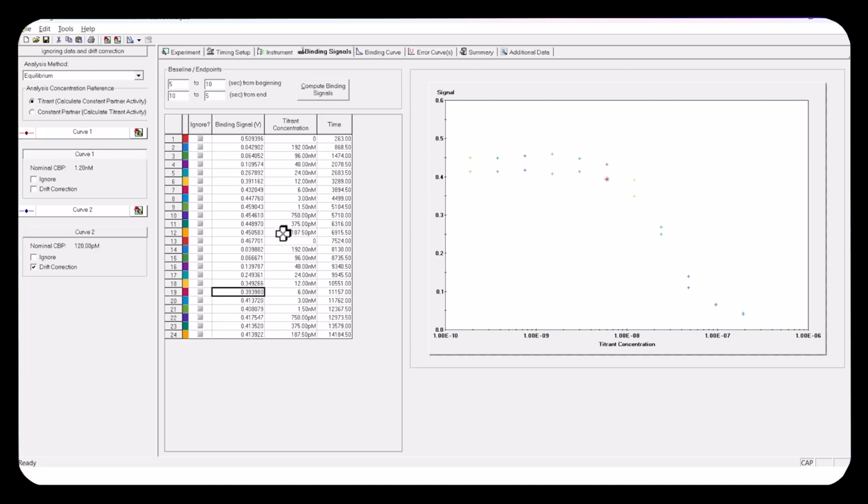I'm looking to see, are they all, the second one's lower? And they are, until this one is higher, and then these two are basically on top of each other. So we have 1 out of 12 or 14 here, 12 it looks like, where 1 of 12 is in the opposite direction. Okay, that's still reasonable. We'll still be able to get an improved fit from the drift correction.